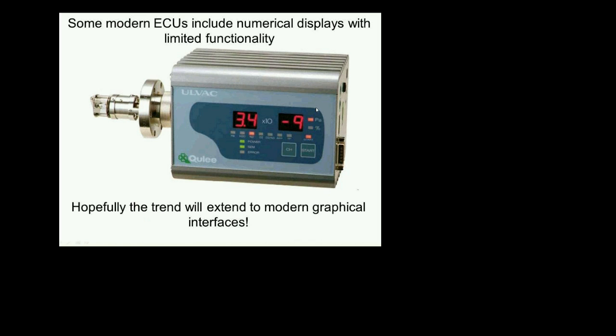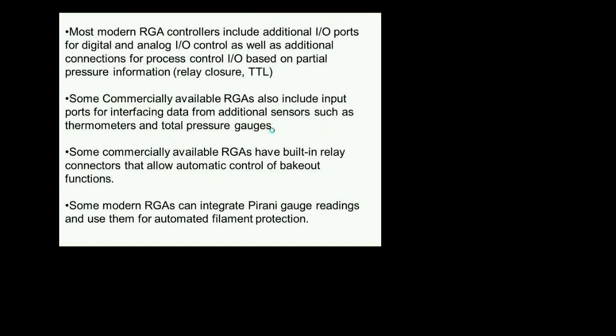And of course, this is another great trick. I really love this, and I wish more vendors would do this, where you actually get your helium, your water, your air levels right here, so you don't even have to have a computer connected to it.